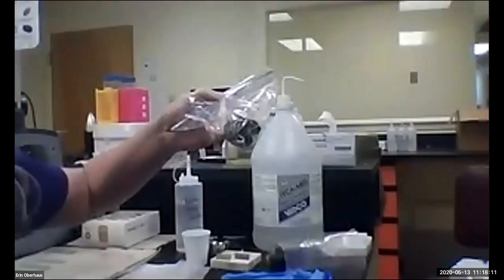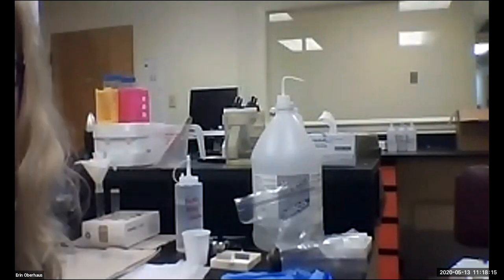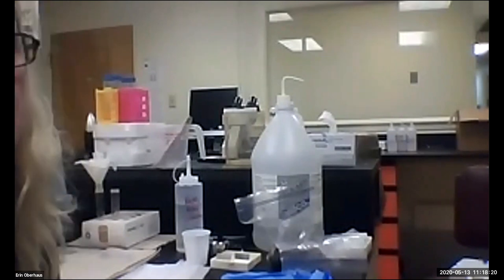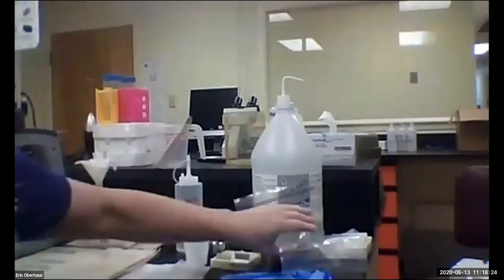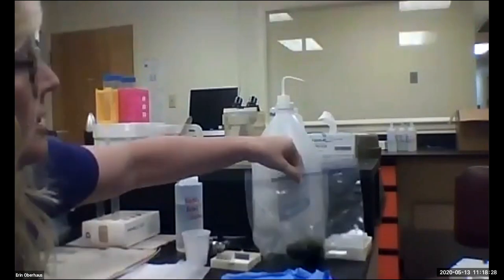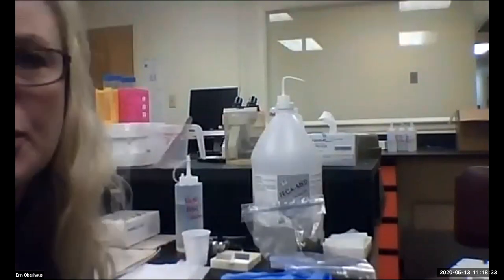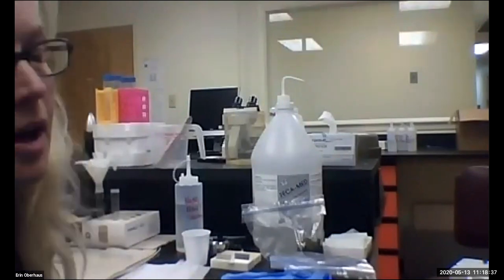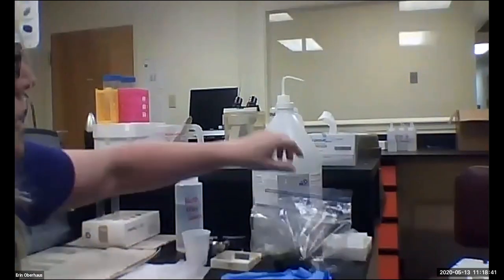You will need your fecal sample, obviously. Ideally, the fecal sample will be fresh, but if you need to obtain it the night before or several hours before, definitely be sure to store it in the refrigerator. Might be wise to also clearly mark it as horse poop, unless you're a prankster, I suppose. If you leave them at room temperature, then the eggs will have hatched and you will no longer be able to visualize them under the microscope. So fresh is best, but if you can't, keep it in the fridge.